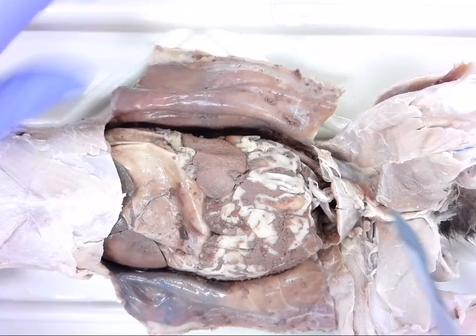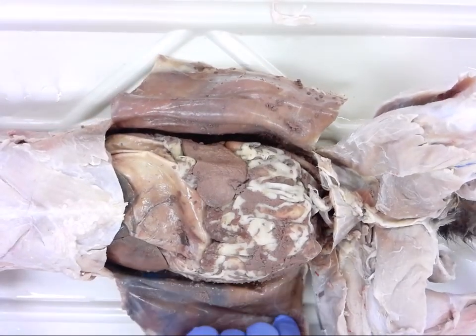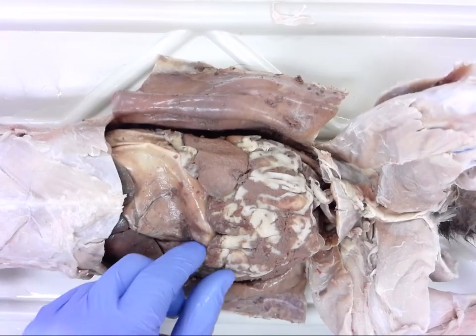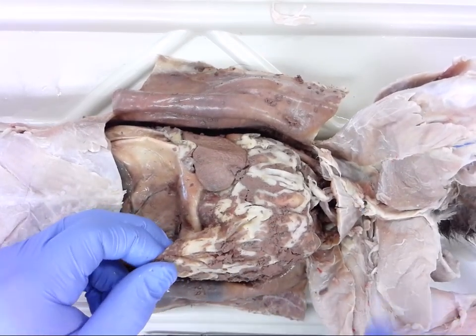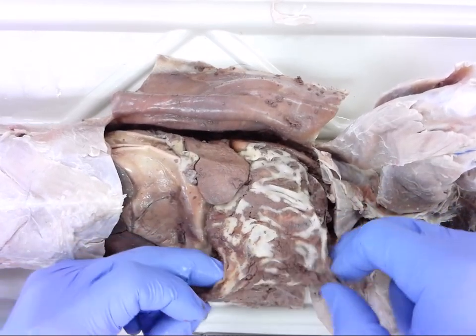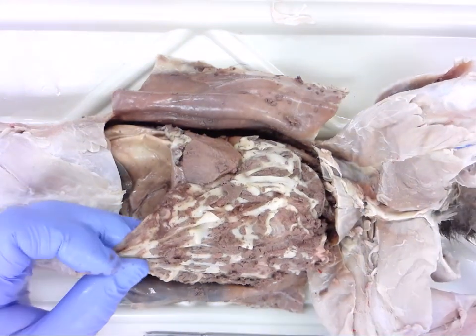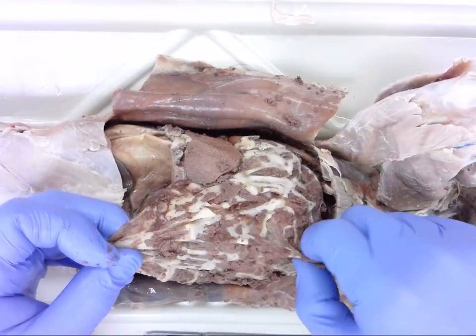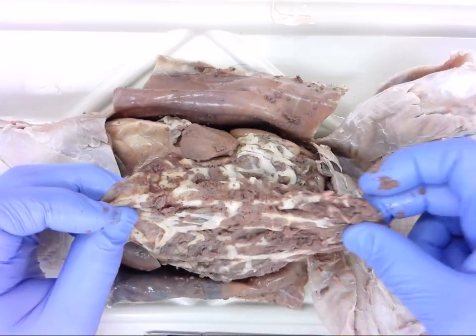Okay. So, as I mentioned, we do have some coagulated blood here, not uncommon, but it's also integrated with this membrane. And this membrane is going to attach to a variety of organs. I'm not going to mention them because there's a lab that you'll have to do that looks at what they attach to. So as you're taking this off, as you're looking at it, make sure that you are looking at what it attaches to for later reference.